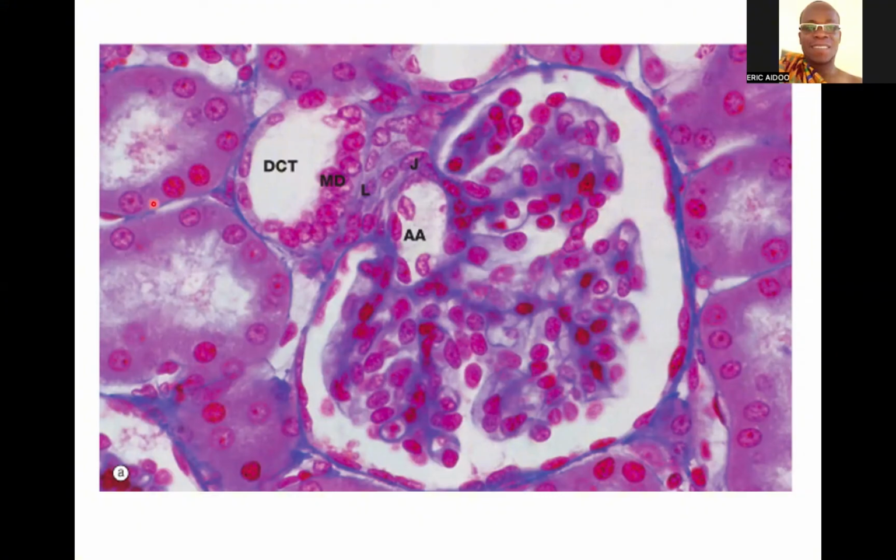Then obviously those tubules we looked at, distal tubules and then also the proximal tubules. And we know that this will be more likely to be proximal, and that is more likely to be, yeah, most of them are even hazy. A lot of them are likely to be actually proximal convoluted tubule.